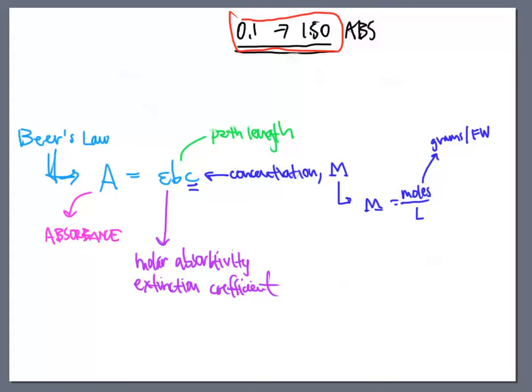So we talked about this concept of molar absorptivity, and we talked about this concept of path length. I want to talk about path length first because it's really the easiest to understand. Again, we've got this instrument, and let's say there's my light bulb, and the light bulb shines on a sample holder, and some of that light comes through and it gets seen by the detector, right? I keep writing this description over and over because I don't want you to forget it. This sample compartment is very important.